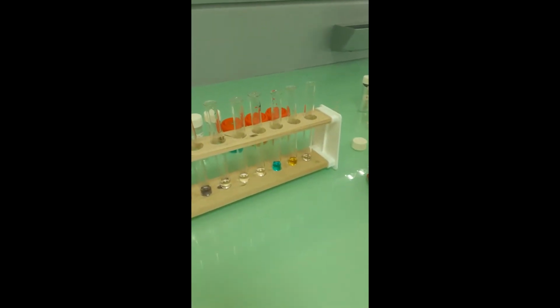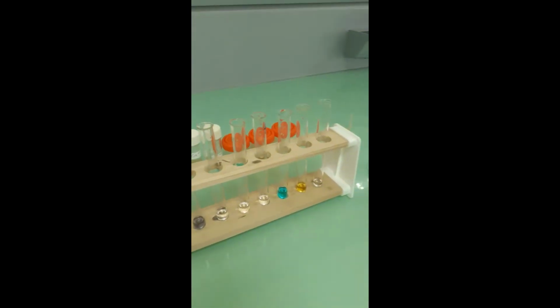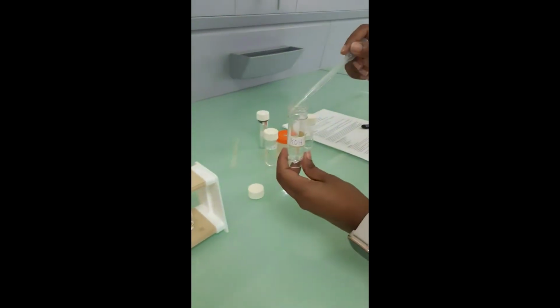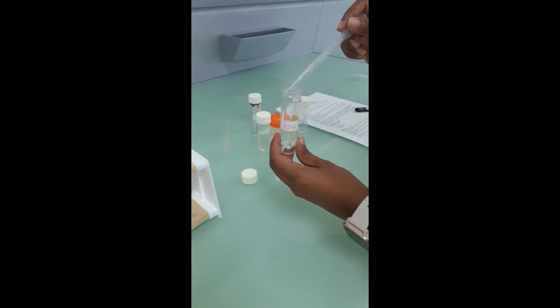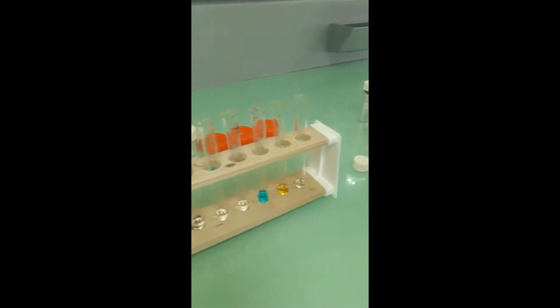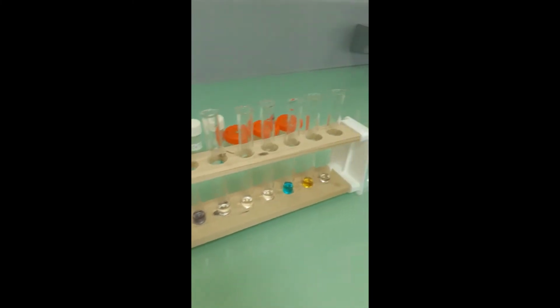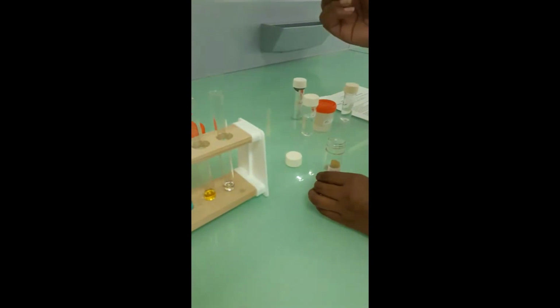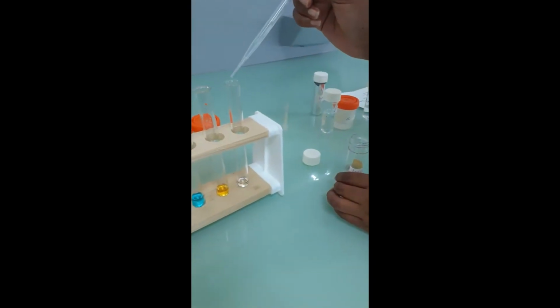So we're now going to start our first test with the metal cations, and in this one we will be adding potassium hydroxide. I know your handout says sodium hydroxide, but we'll be adding hydroxide ions to each one of these metal ion solutions, and then you'll make your observations. So the first metal ion is Fe2+.